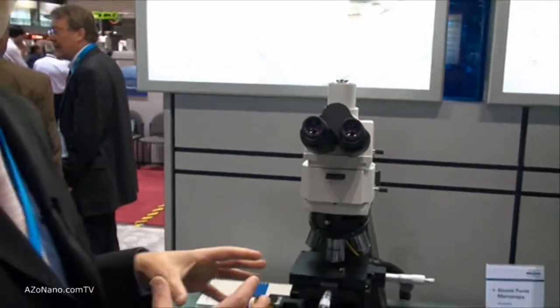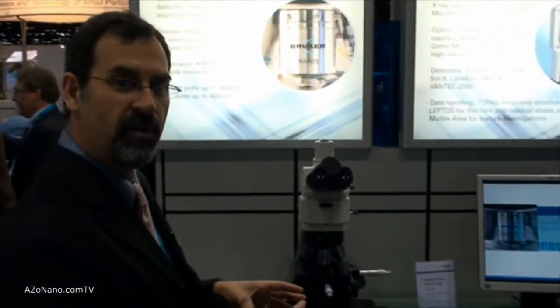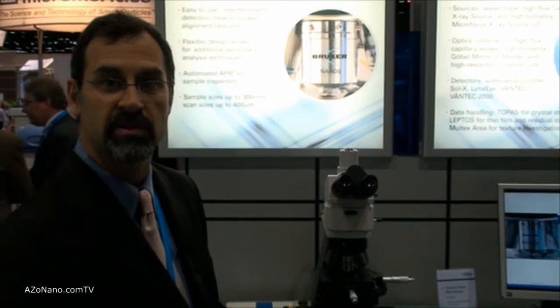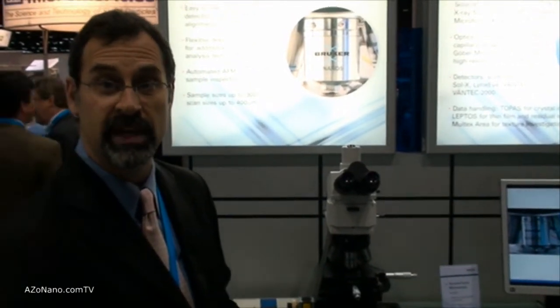So you have full AFM capabilities, full optical microscope capabilities. Find your point, find your defect, find your point of interest.